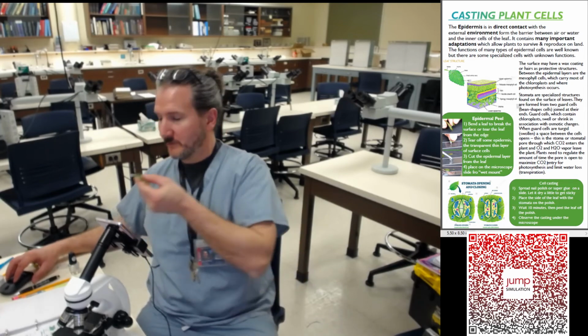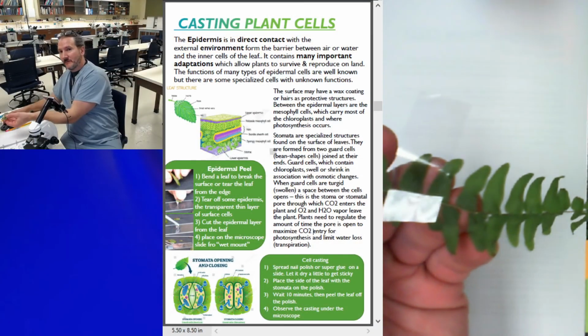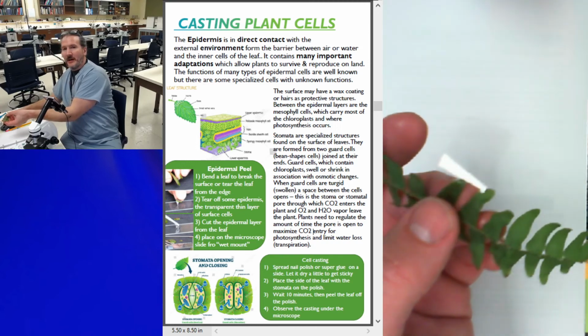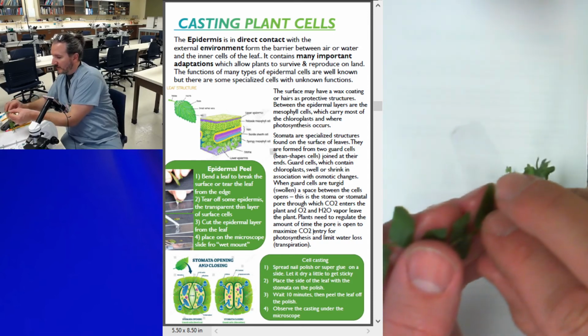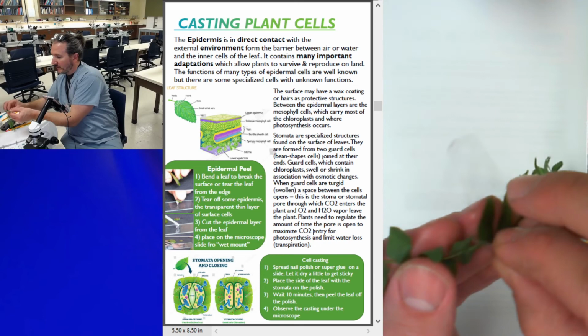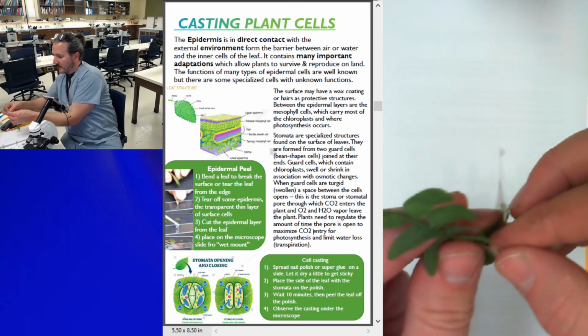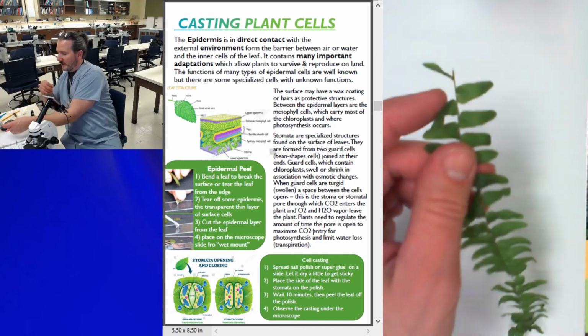Okay, so it's been about 10 minutes. Remember, you just super glued, basically, or glued the bottom half of the leaf. You put the tape on. Hopefully that quick drying nail polish is dried. We're going to peel this tape off. Slowly. Oh yeah, there it went. Okay, there's our leaf.